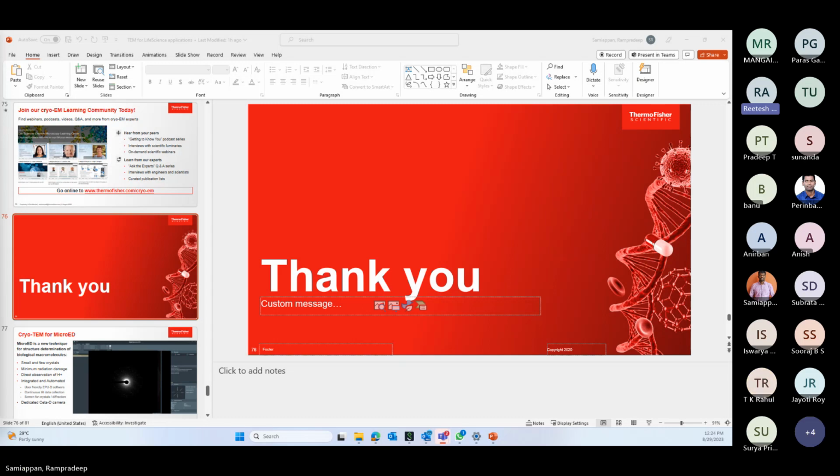It's actually quite a bit of work to work on different constructs of MSP, and I have a few constructs, and they are actually available through Addgene. One can buy them directly, and then people can use DOPC. DOPC and DHPC are something that you have to try with different kinds of MSP to get various sizes of nanodisc. There is an optimization process that we have to do. The correct amount of lipid to protein ratio is important here.